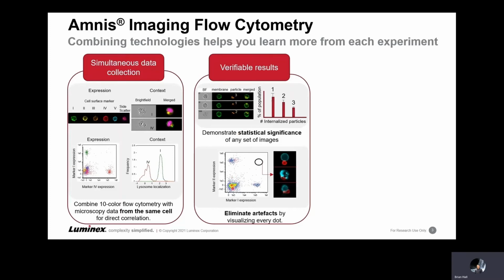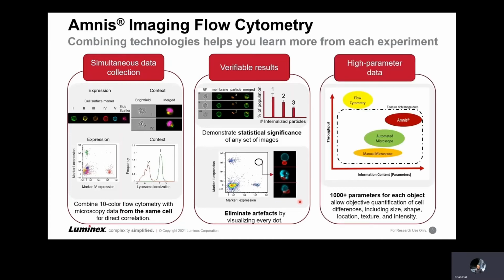You can also look at marker expression, and by looking at the double positives, you can identify cells that are potentially T cells binding to antigen presenting cells, as in this image, or is the fluorescence overlapping just on the cell surface of one large cell. So it allows you to really understand what's going on physiologically with your samples.